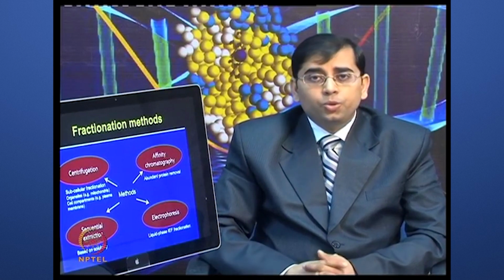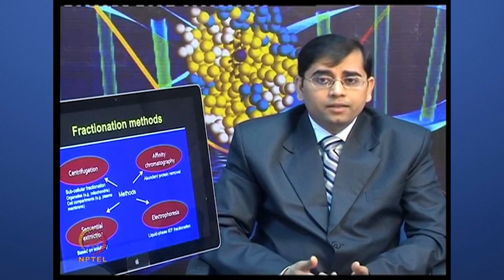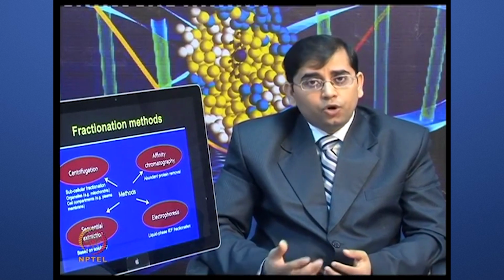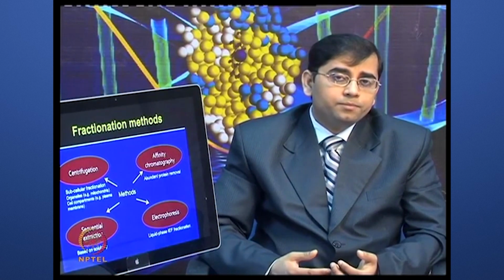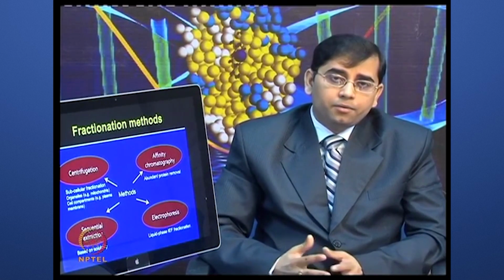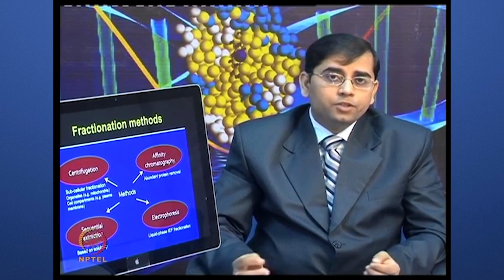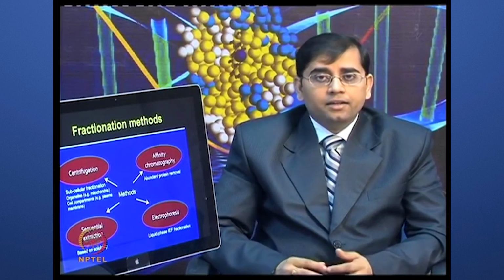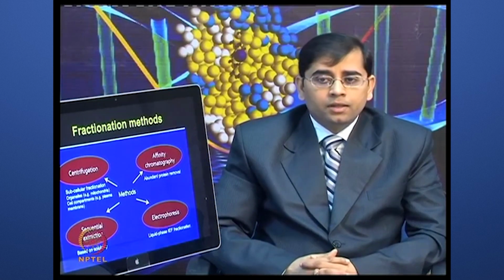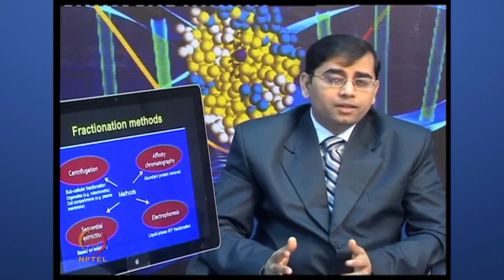Electrophoresis can be used for fractionation. For example, if you are using a gel free method, where you directly want to extract the protein and analyze it using mass spectrometry, then rather than applying the whole sample directly to liquid chromatography, one can first simplify the proteome by using isoelectric focusing and doing the IEF process in the liquid phase itself. The liquid phase IEF fractionation can simplify the proteome based on the isoelectric point.